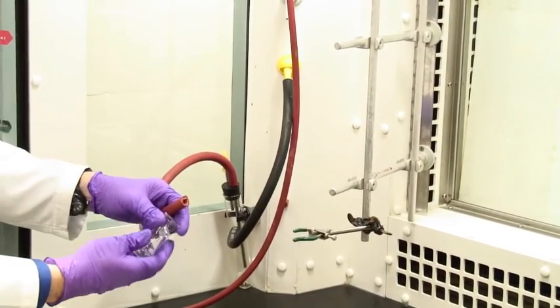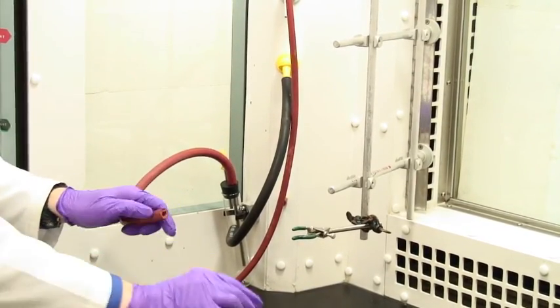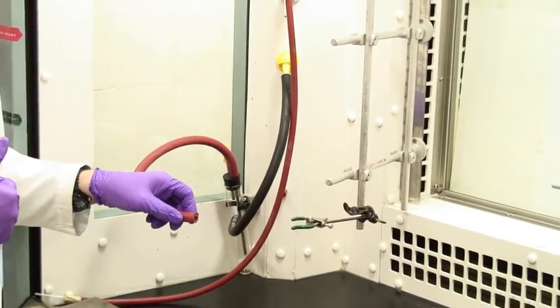Notice that the vacuum tubing and the Buchner itself have quite heavy walls. That's so they don't collapse under reduced pressure.